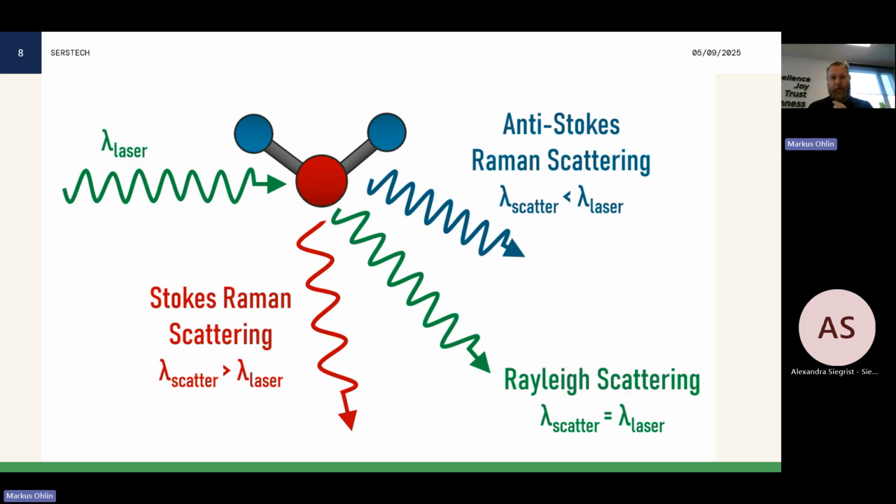So you require quite a lot of energy to do this. And so you have to be careful and take care of whatever little light you can, and try to get as much out of it as possible. And I will come back to that later. That also comes into play with 785, because 785 nanometer provides more of this Raman scattering than 1064 nanometer does.